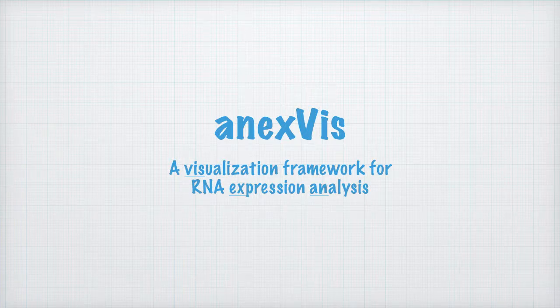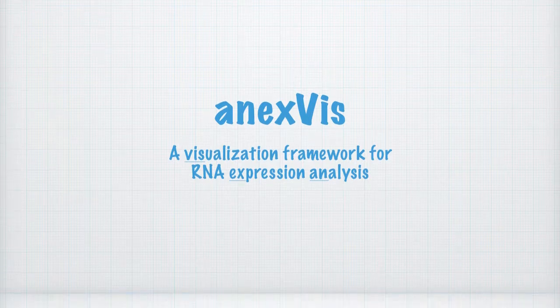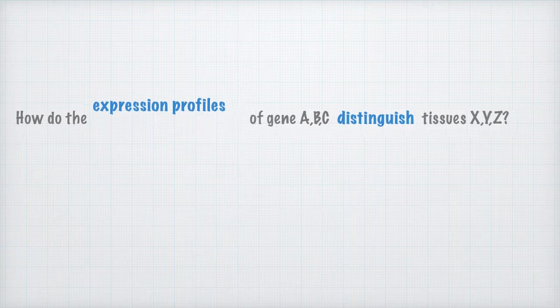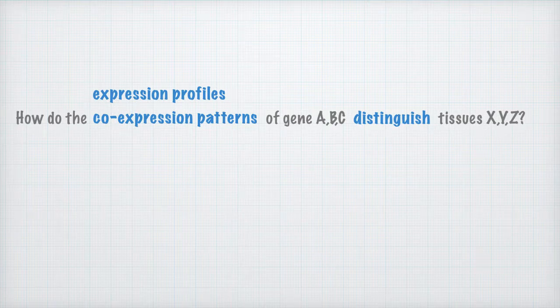We would like to introduce a visualization framework specifically designed to facilitate RNA expression analysis, motivated by the questions usually encountered in glycobiology, that is, how the expression of a set of genes are different from one tissue to another, and how their co-expression differs in those tissues.